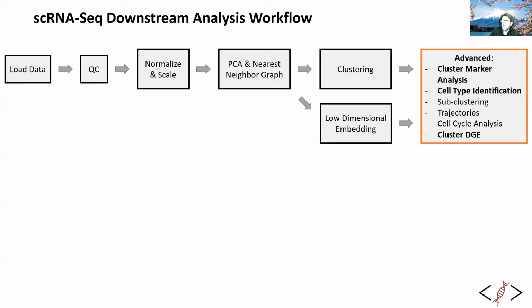But we're now going to step into a few even more advanced topics, including cell cycle analysis and trajectories. And one more thing, which is not even on this list, which is just generally how to build module scores. So that's the main thing we're going to do today. And then we're going to touch a bit on how to integrate data sets, which is not even necessarily an advanced topic, but just an important practical skill to have when you're doing single cell.